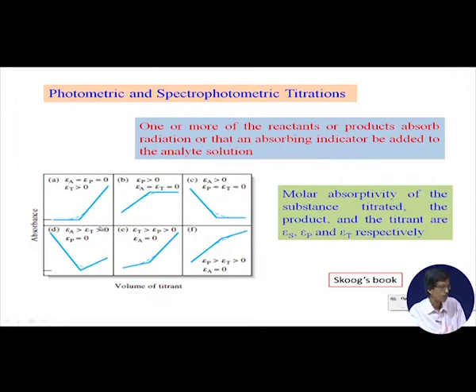So, when you go for this typical titration, this is your endpoint, this can be your endpoint, this can be your endpoint, this can be your endpoint. Like your conductometric titrations, when you see the corresponding ionic conductance in the solution, the electrical conductance of the ionic solutions is changing, and there is a sharp change in all these cases. So, a sudden change: this part is horizontal, then a sudden increase is there. This is monotonically increasing, but after some time it keeps horizontal; this is decreasing, then it keeps horizontal, it is decreasing, then after the end point it is also increasing again.